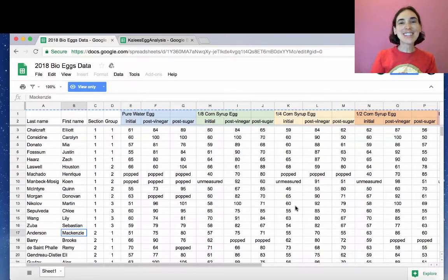Hi everyone. Today we'll be going through some data analysis for the biology of eggs experiment. Please follow along with your own data as I do this so that you don't have to watch this video again later when you have to produce these graphs.